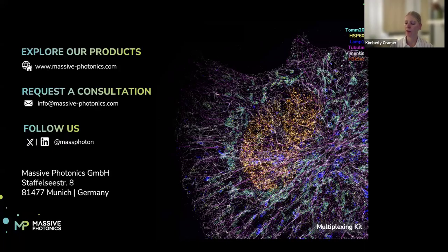Because you can imagine if you're using DNA paint within the nucleus, you're using these shorter sequences, and these might, for example, cause high background within the nucleus. So there are ways to mitigate this as well, such as left-handed DNA, or looking at the specific sequences very closely.